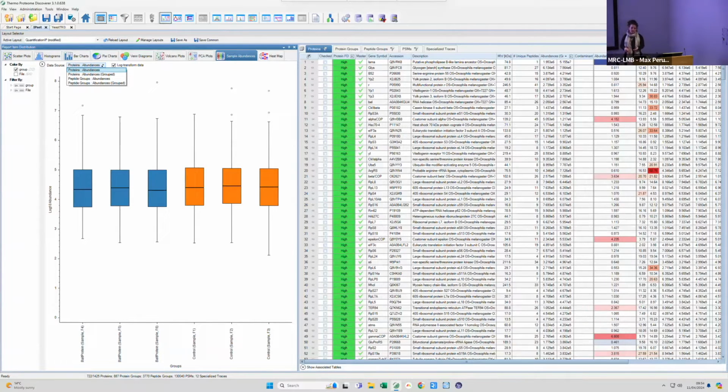and that can be dangerous. In most situations, the variability that comes from an IP comes from the whole workflow that you're doing. So basically, if you control really well the input that you use to do the IP and the amount of beads that you are using, make sure that you're using exactly the same amount of beads, and this is quite important. Usually, you can control this variance quite well. And that was the case. This is absolutely no normalization applied, and you can see that the overall protein abundance distribution is very similar between all the samples. That's exactly what you want.